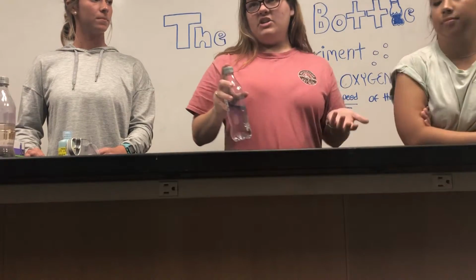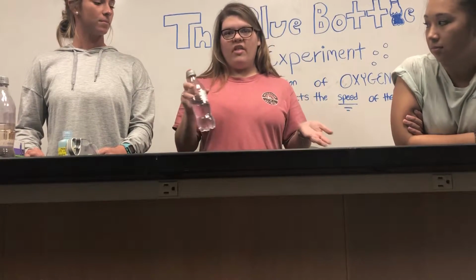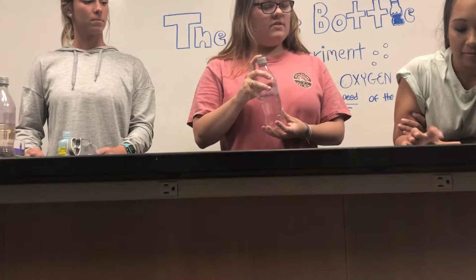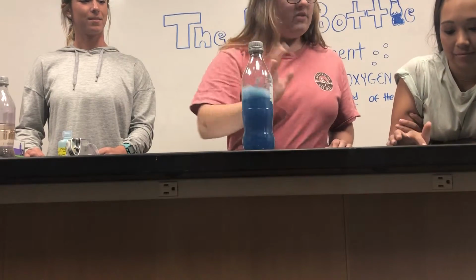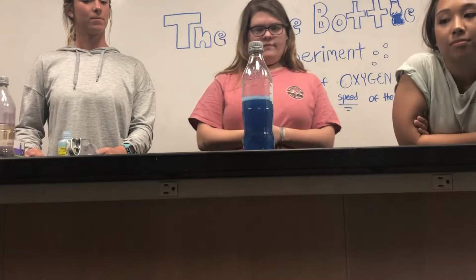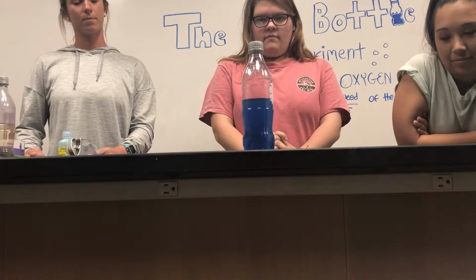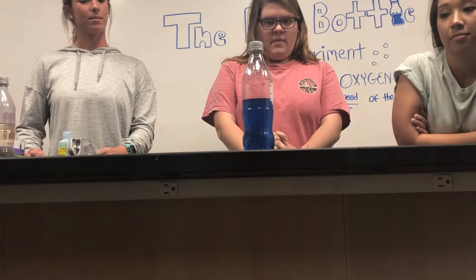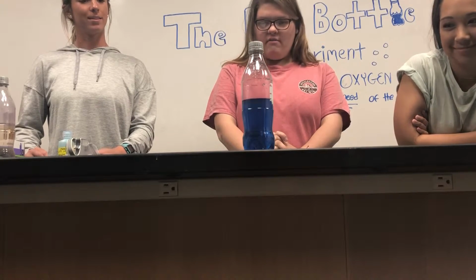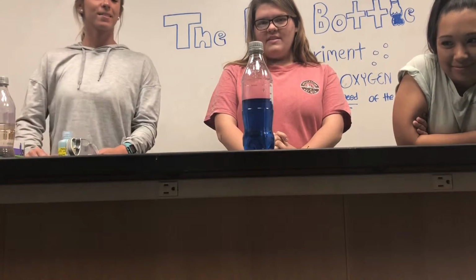So now we're going to shake it probably about 5 times. Let's do about half that, and then we'll do double that and see how that affects the rate of the reaction. So we'll reset the timer. 4, 5. And we'll start it again.